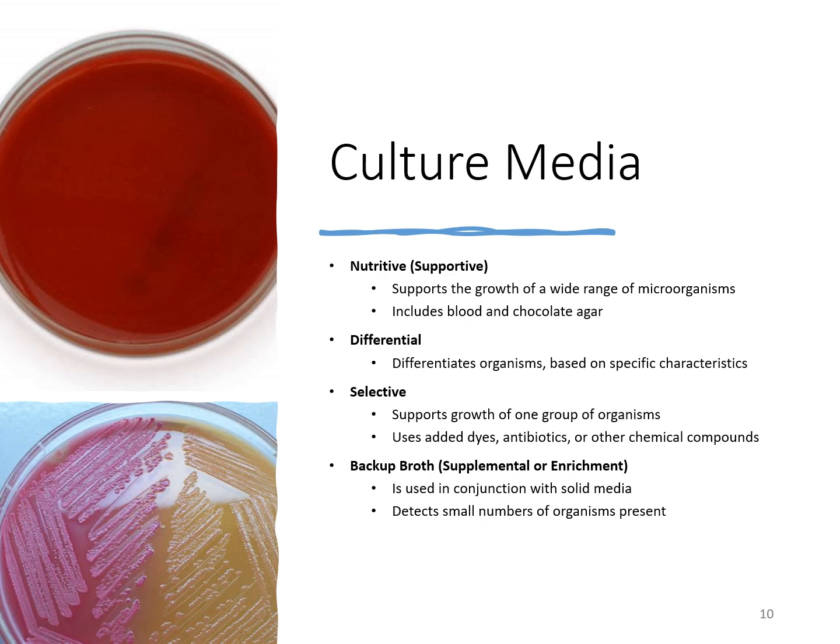You can also have backup broths, which can be supplemental or enrichment. This is typically used in conjunction with your solid media, and it can help to detect when there's just a small number of organisms in that culture swab or whatever specimen has been submitted.